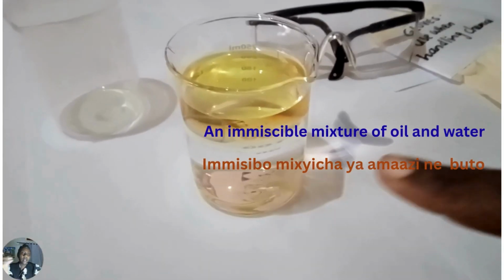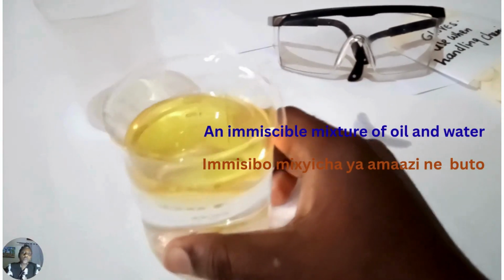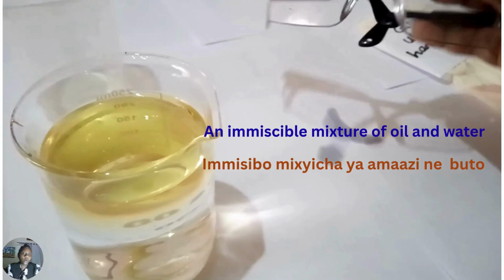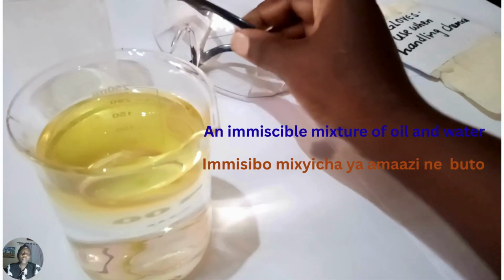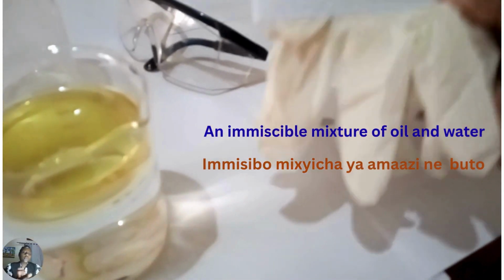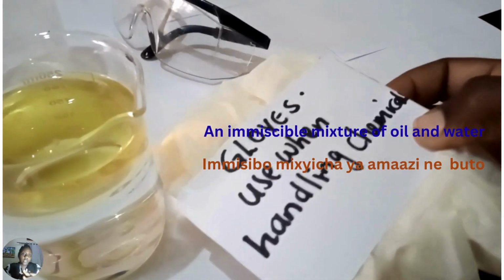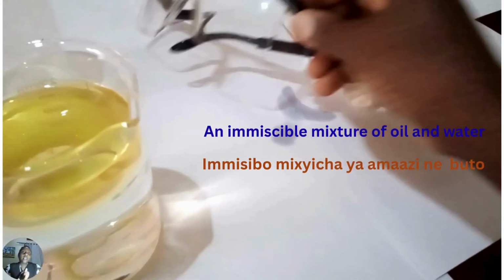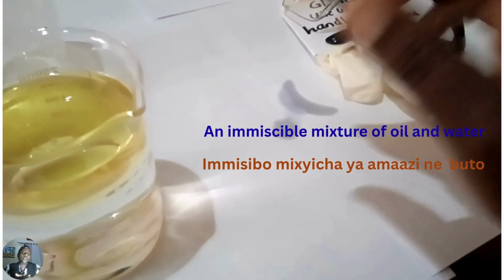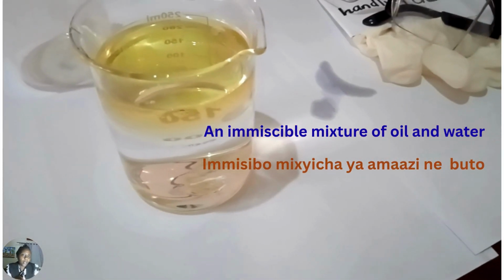So when you mix the cooking oil and the water, these are the two layers that I'm showing you. You see the oil goes up and the water is down. You will need some eye goggles and gloves when you're dealing with these materials because some of the liquids are quite toxic, so you need to cover your hands with gloves when you're handling the liquid. And you will also put on eye goggles, especially when you're going to separate this mixture. But you can see that the oil goes up and the water goes down.